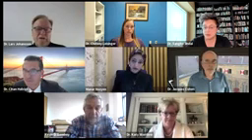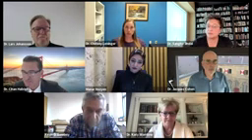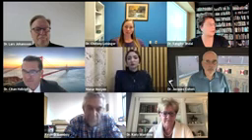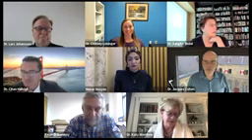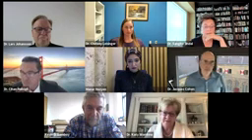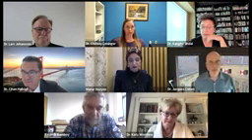I see. Kevin, can you speak to the levels of VOC and particles that you're trying to achieve in an IVF lab clean room? Well, I'll let Katie touch on that a little more. It all depends on what area of the lab and things of that nature. Katie, you want to jump in a little bit on that as well? Absolutely. Kevin has tremendous clean room experience. With IVF, we try to hit the metrics that we learned were so important for consistency. Yeah. So really, under 5 is not uncommon for those kinds of labs, for the in vitro labs.